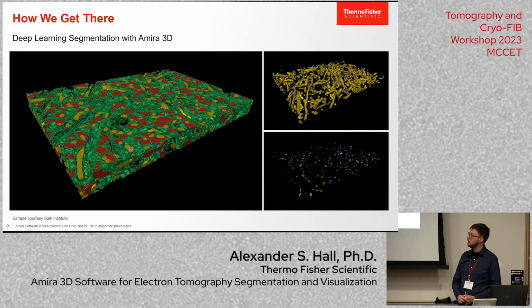So the spaces between axonal dendrites. On the right, just to illustrate another way that you can use segmentation, because we now have voxels assigned to particular materials, we can view them one at a time. We don't have to view it all as one very crowded mess. We can see in 3D how only one of the phases looks. So at the upper right, these are the mitochondria.